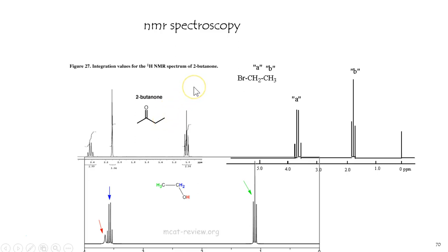Let me tell you what the NMR spectrum would look like. Well, the intensity, that means the area of each peak, is simply proportional to the number of hydrogens. So this CH3 region here will give rise to something that has an area relative to the size of 3. This will be 2, and this will be 3. We'll get 3 peaks. There they are, 1, 2, and 3.